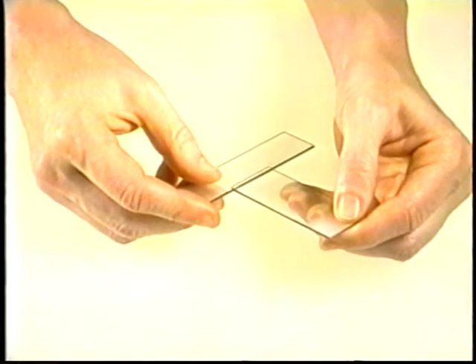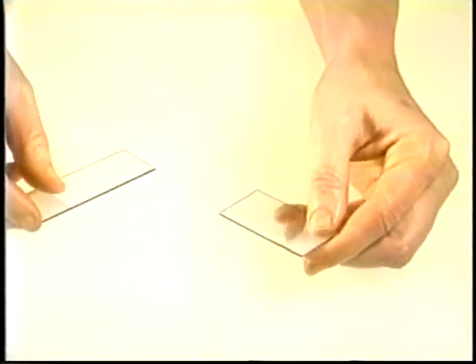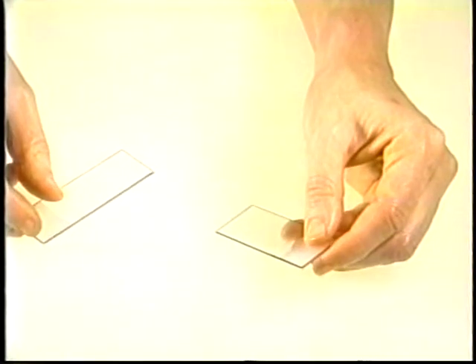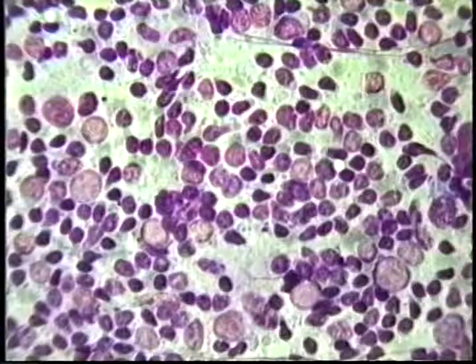The 2 slides should be kept parallel throughout the smearing, and the pressure should be light, just enough to spread the cells. The finished smear should have an oval configuration with even thickness, and virtually all the material will end up on the bottom slide.